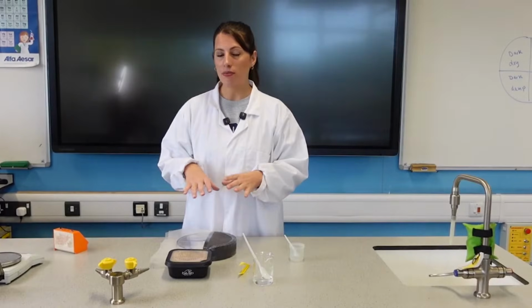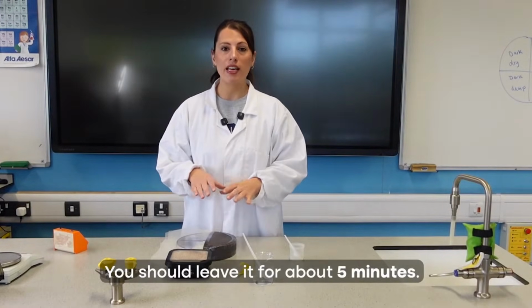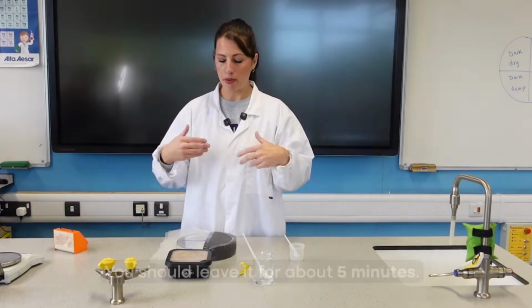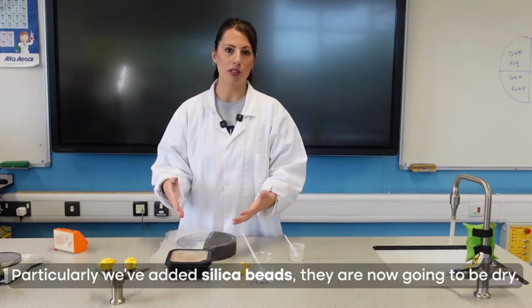So now we've set up those different conditions in the chamber. You should leave it for about 5 minutes so that it does acclimatise. So we do have those sections that we said are damp. There is time for that air to become damp. The sections that we've said are dry, particularly if you've added silica beads, they are now going to be dry.